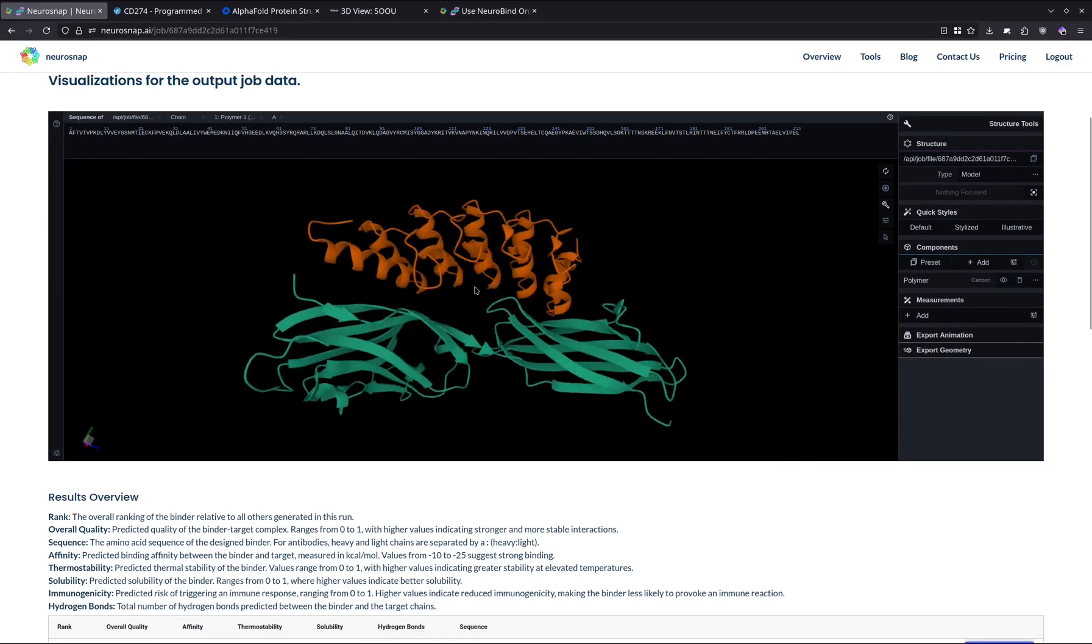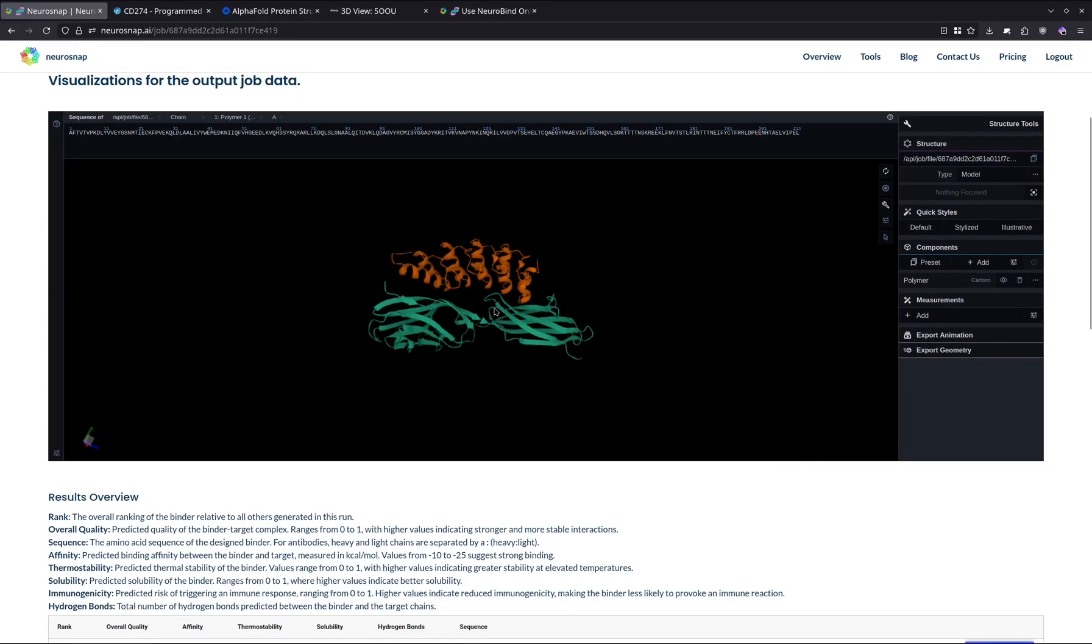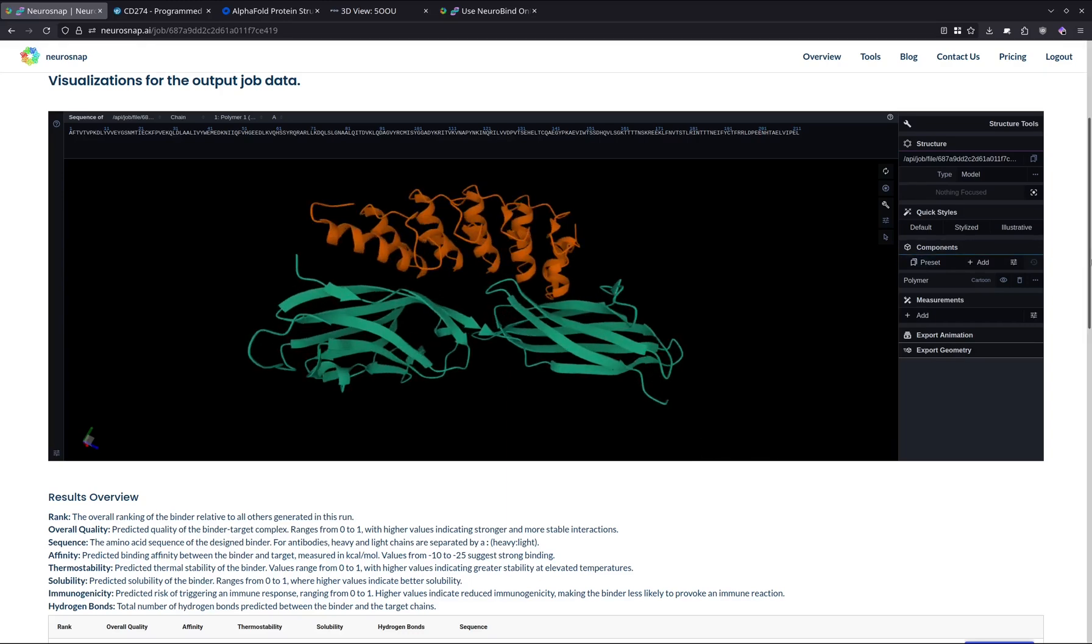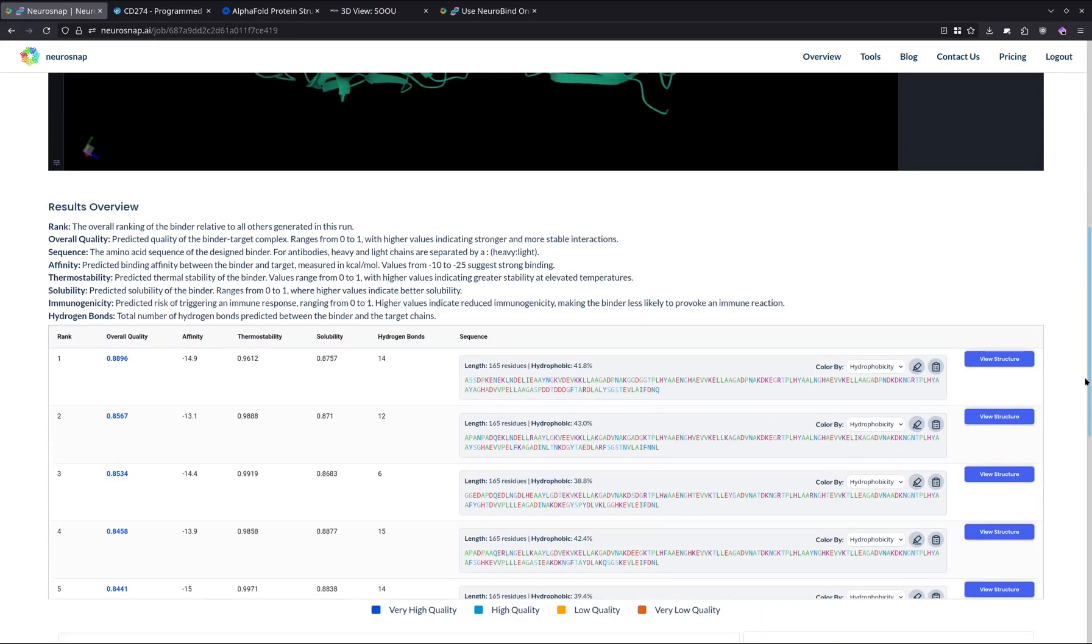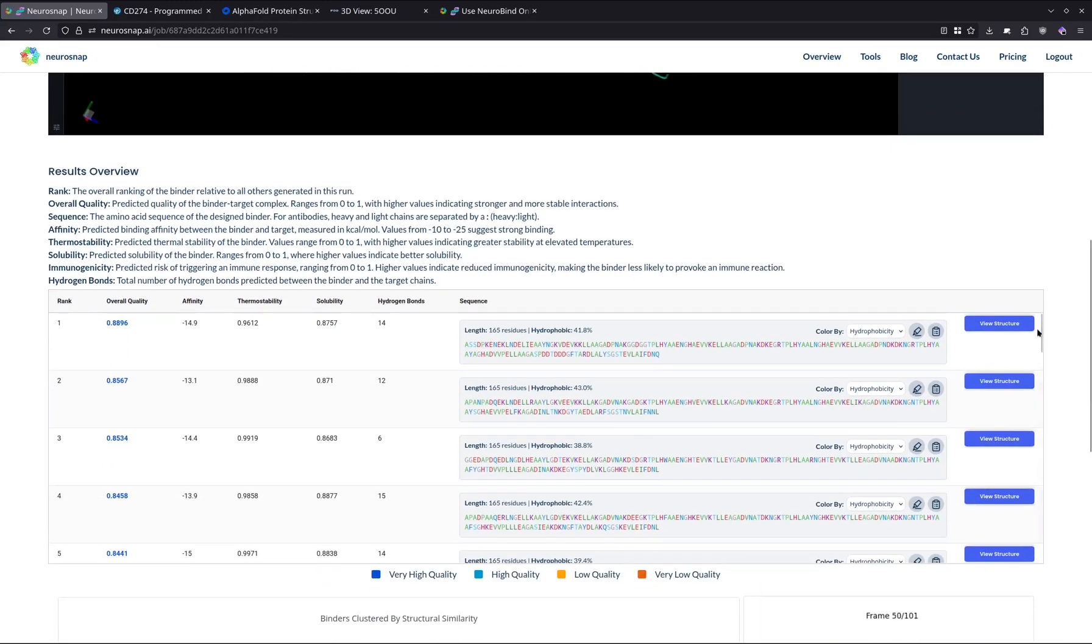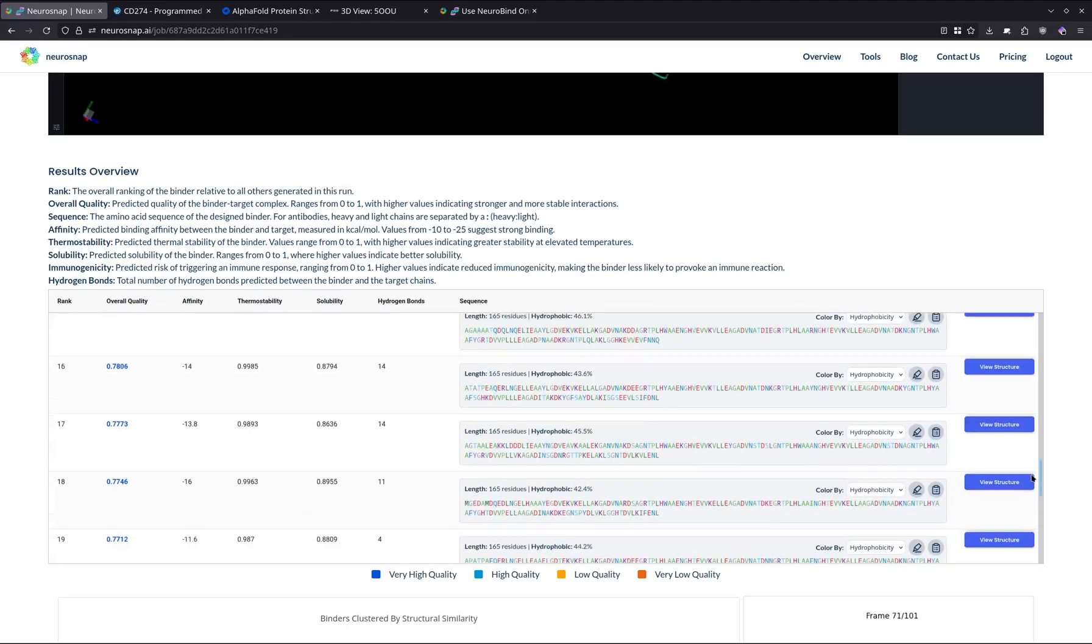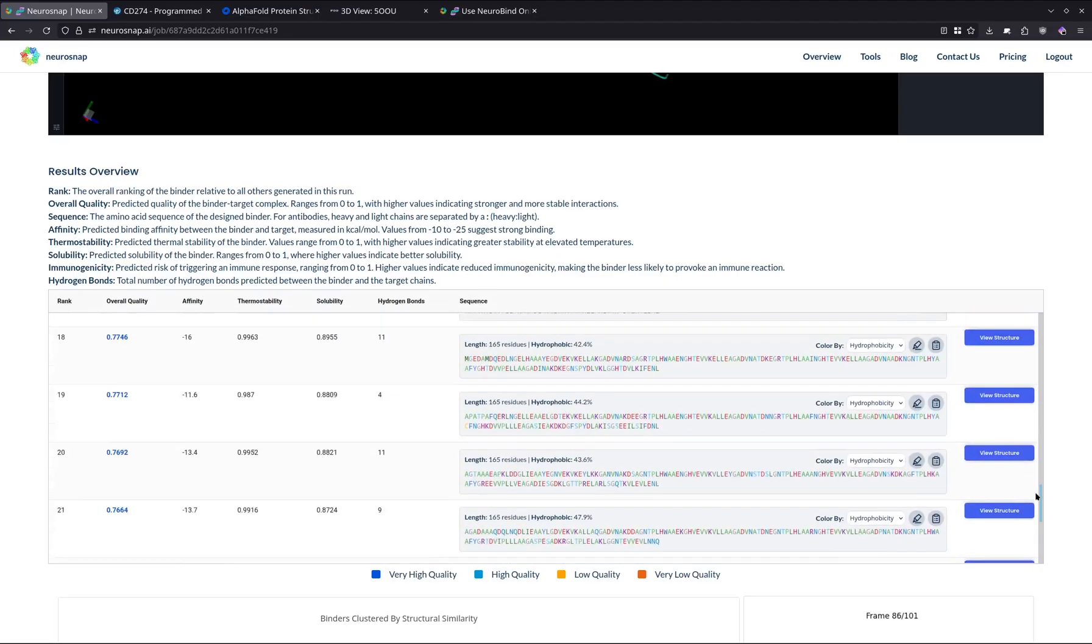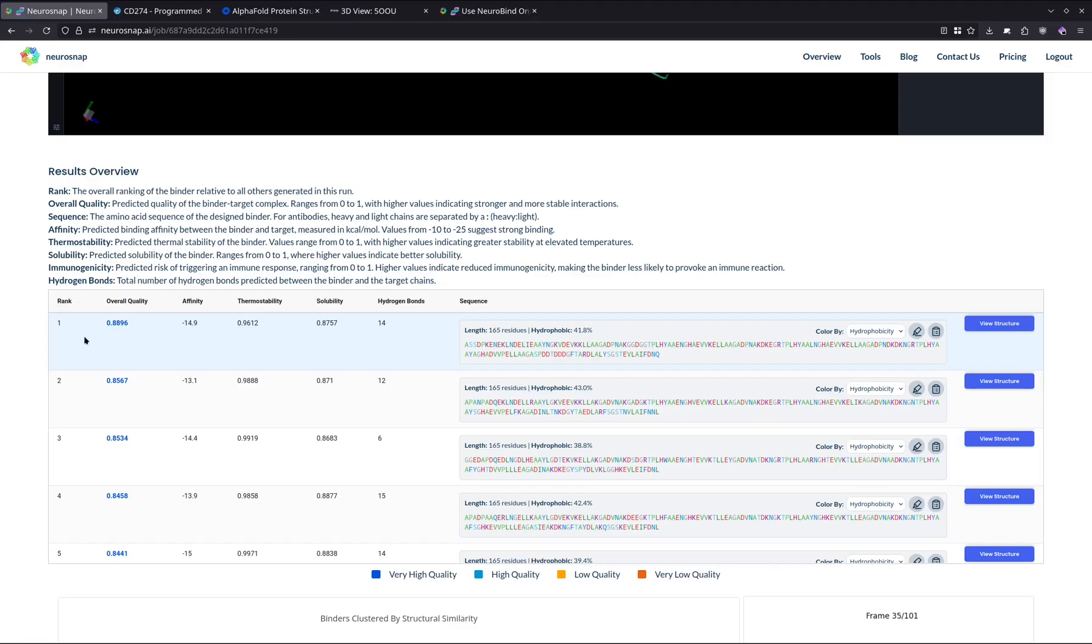So we're just going to go ahead and get started with the actual structures. The first structure we're going to be looking at is the rank one structure. This is the structure that is predicted to be overall the best by NeuroBind, and we can see all the different rank structures over here on this table. NeuroBind by default outputs 25 structures. The best part is we also get various metrics that can help us decide which ones we actually want to take to a wet lab setting or an experimental setting. Overall quality is the most important metric in most cases, as it gives us an estimation on all the different properties and represents the overall quality as the name entails for that candidate.